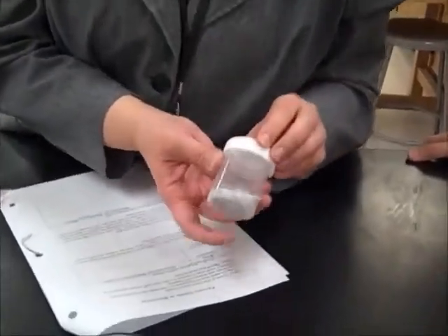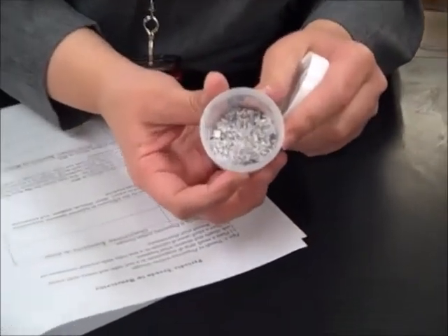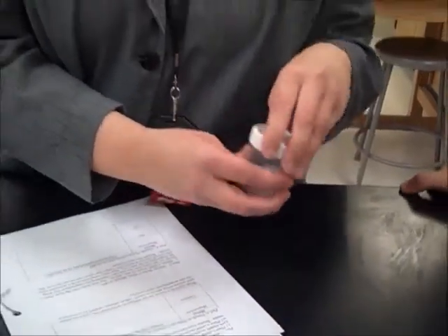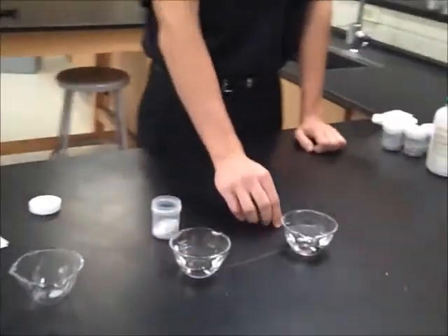Calcium is the other metal we're going to test. And they're both in the same group. Calcium's a little bit harder than magnesium. So we're going to see what happens when we put them into water. Go ahead, Nick. It's all yours.